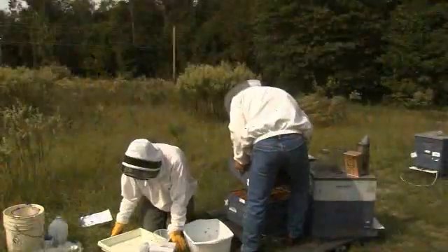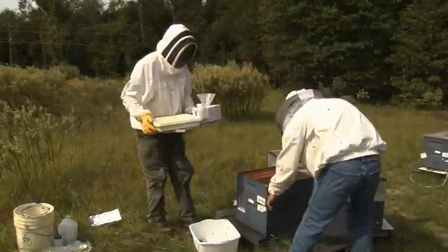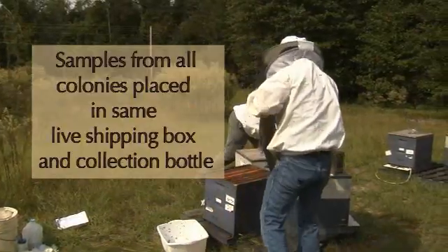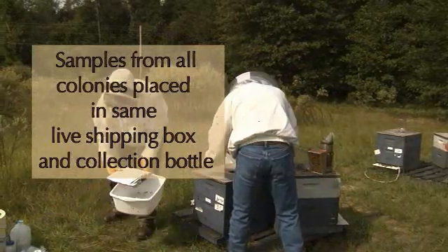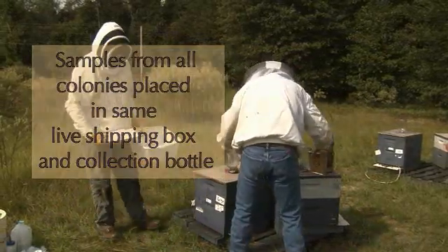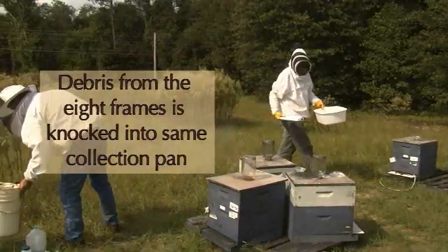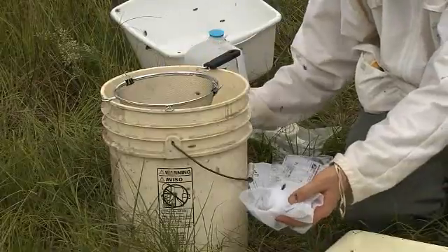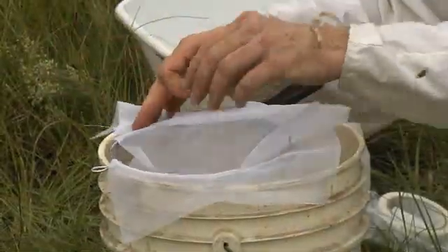Close the colony. Repeat these steps until all eight colonies in the apiary have been sampled. Note: we are sampling at the apiary level — samples from all colonies are being placed in the same live shipping box and large alcohol collection bottle. The debris from all eight frames is being knocked into the same collection pan. Take the nylon filter, dampen it to prevent it from blowing in the wind, then fasten it with binder clips to the strainer.